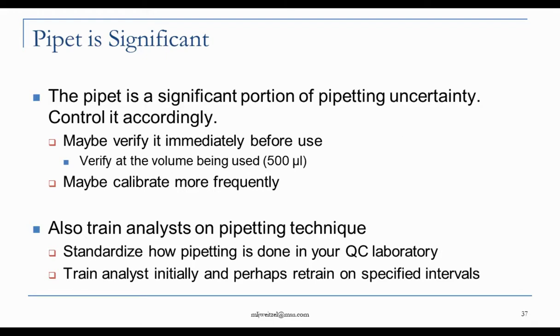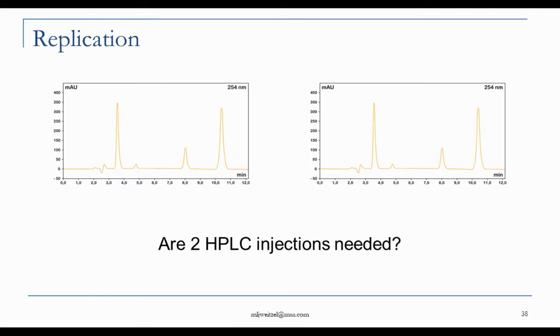I have seen labs do this. When I directed laboratories, I implemented some of these trainings, and you could measure the improvement in the fewer OOSs post-training. The control charts got tighter. It really was very effective, and I've seen it when I audit labs as well. And so that's why it is a significant component of the uncertainty, and it needs to be controlled.